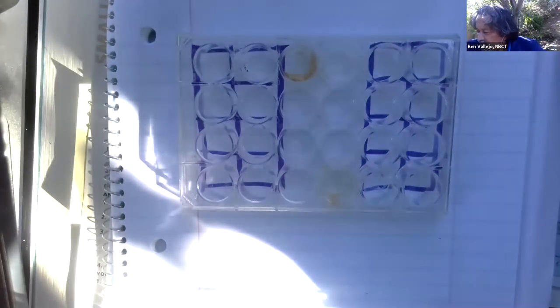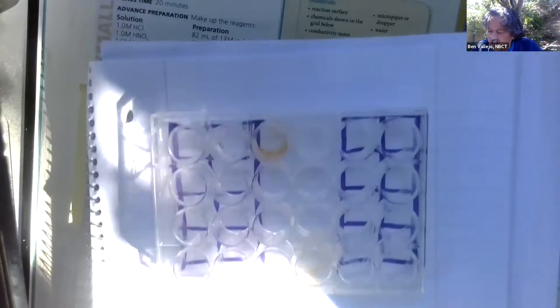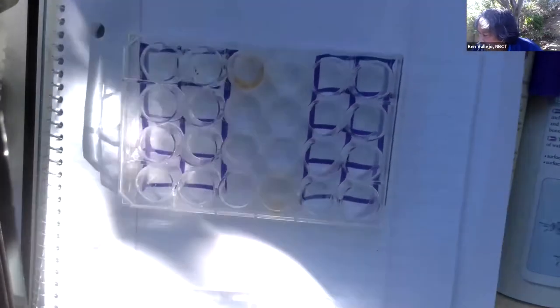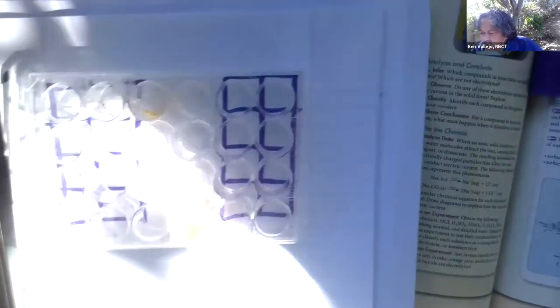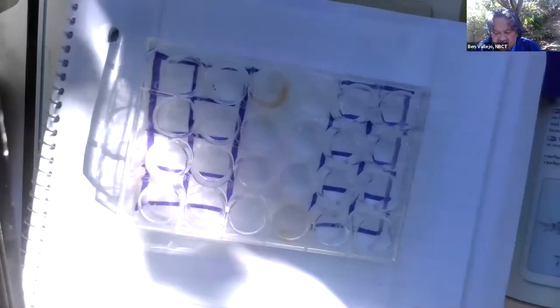And I put the solids in there. What are the solids again? The solids are, we went over here. Salt, baking soda, cornstarch, sugar. This one's baking soda. All right, so let's put those in there. So a little bit of salt, a couple of grains, it says. Place a few grains in there.